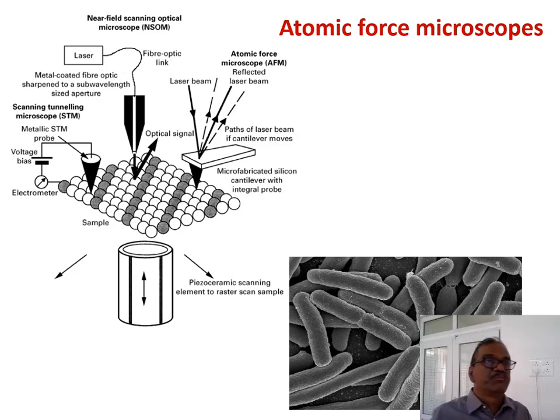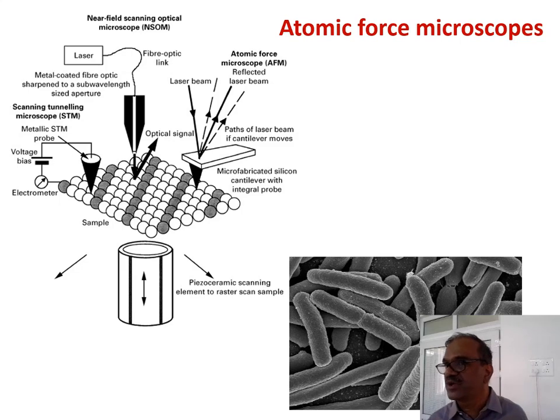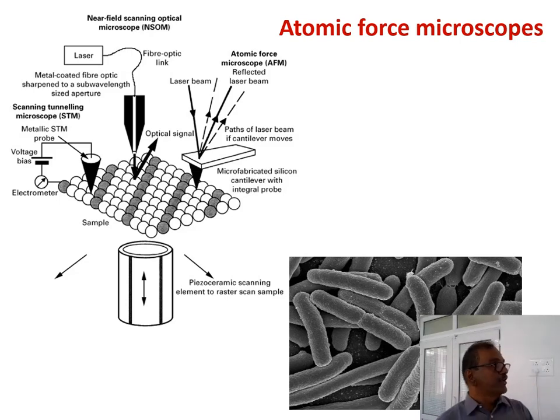Okay, now in a camera it is in pixels. How many pixels you have used and what type of camera was used. The same thing in the microscope: you have to write how much magnification you have observed, because if you are comparing two different objects at two different magnifications, and saying this is bigger and this is smaller, you are committing a mistake. Okay, under the same magnification, how does it look? So that is the most important one.